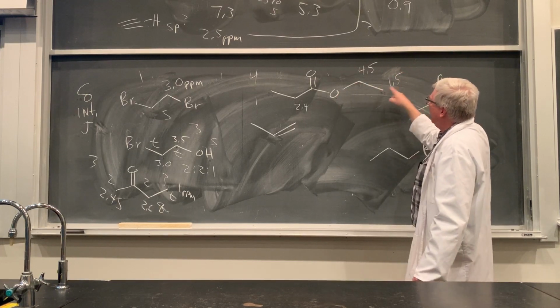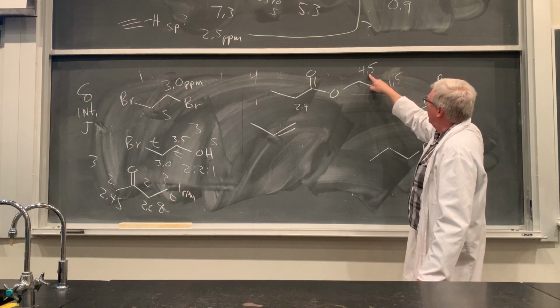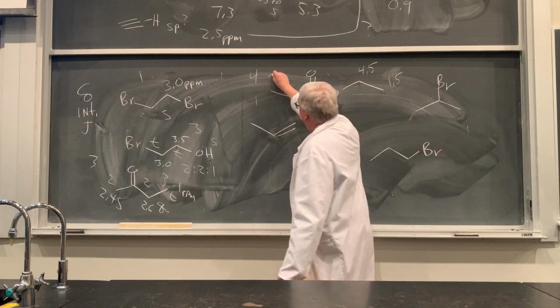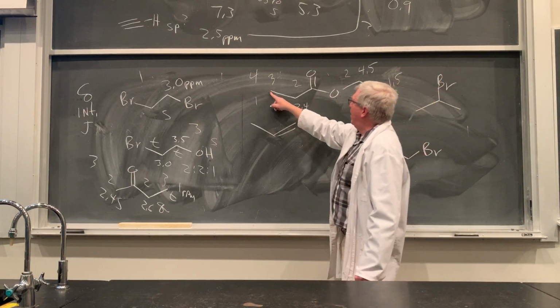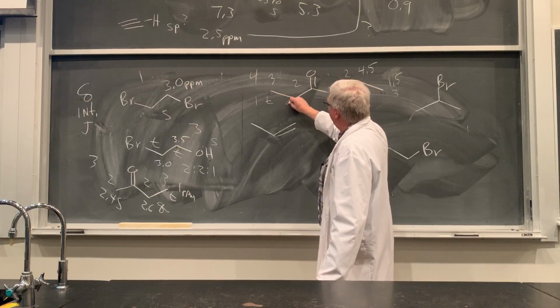And this proximity effect to a heteroatom tails off quickly, so this would be much more shielded than this one. Highly deshielded those. And what do you get? 3 to 2 to 2 to 3 for the integration. And what about the multiplicity? How many neighbors here? 2. Yep, you get this triplet. How many there? 3, so quartet.